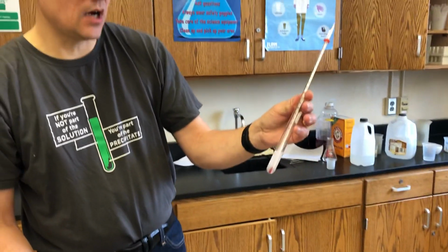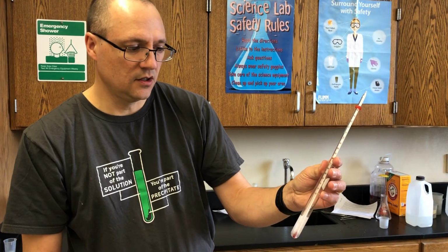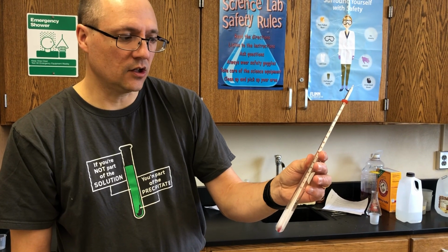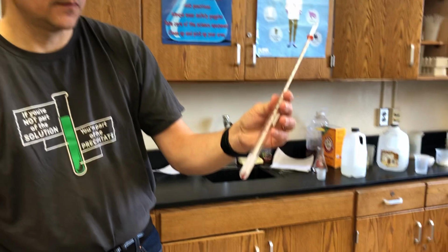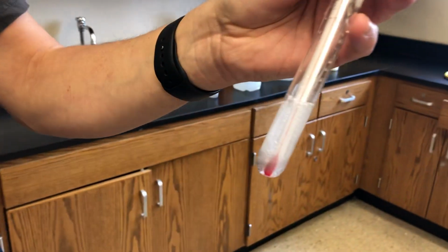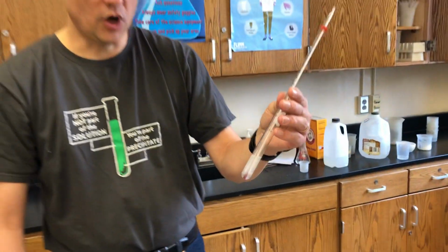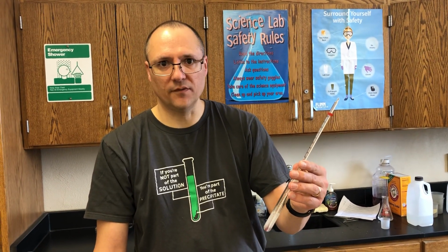At this point in time, my thermometer has risen to 24 degrees Celsius, but we're going to go just a few more moments because it may increase even further. Okay, so I'm going to call the final temperature for part 1, the zinc and the HCl, the final temperature is 25 degrees Celsius.